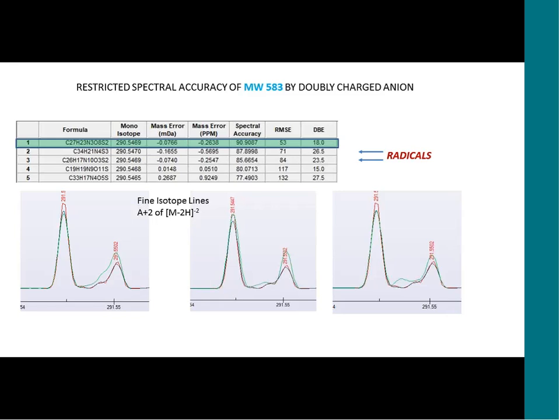If you're a mass spectrometrist, you'll get this. Those are radicals. And that's because when I'm doing searching, I don't specify if I want even electron or odd electron. Even though with electrospray data, you have a tendency to want to say even electron data. It's true, especially in negative ions, that if you're dealing with a fragment, you can see radical ions.